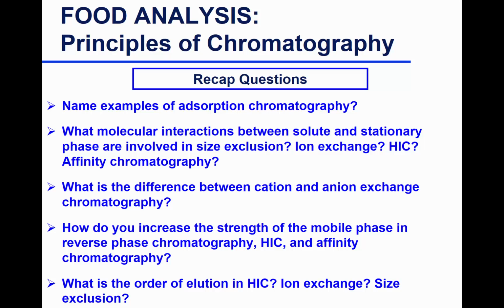I saw Agnes' hand up for adsorption chromatography. You put your hand up for something, didn't you? No? Okay, never mind. Delayed response from me. So you said affinity chromatography, ion exchange chromatography, hydrophobic interaction chromatography. These are all specific forms of adsorption chromatography. But you can have a general form which is based on, if you have silica, for example, an interaction based on polarity. So this is not really a very specific type of adsorption chromatography.